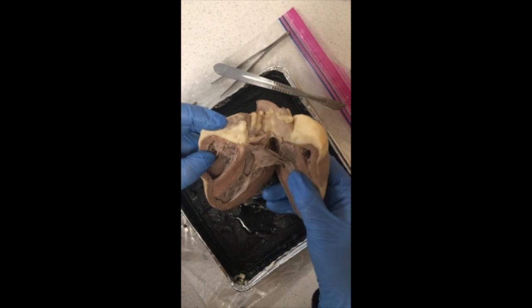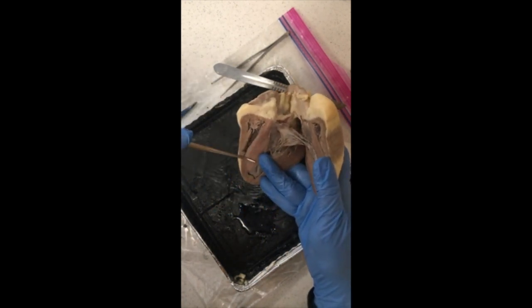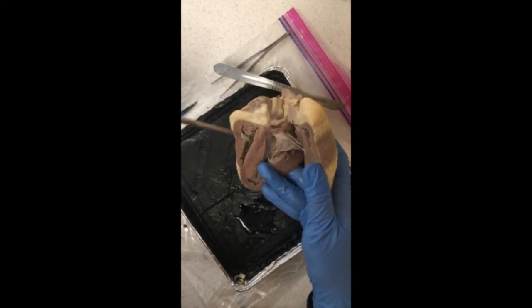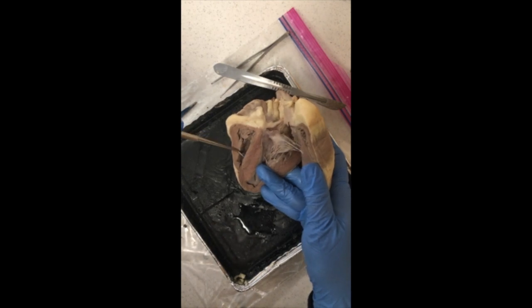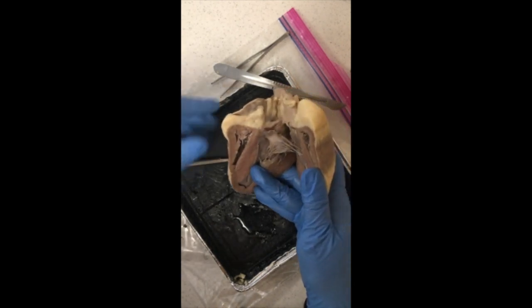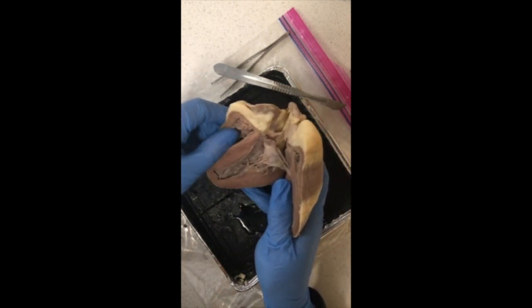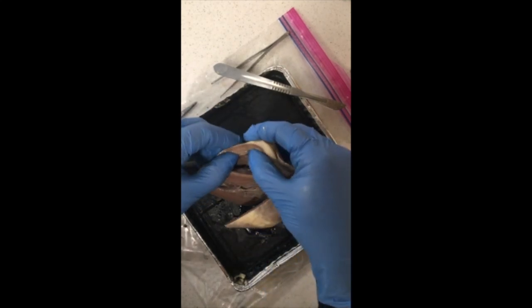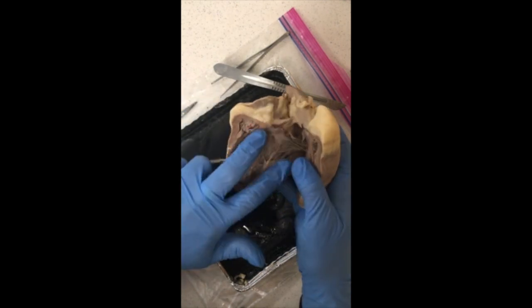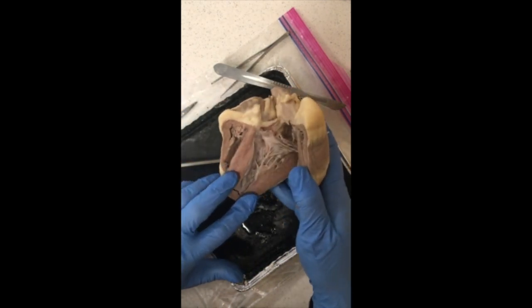As we dissect the heart, we can see the different muscle thickness in the different ventricles. We have our right atria and right ventricle here, and we have our left atria and left ventricle here. Other things to note is the thickness of that myocardium, that heart muscle. In the right side, it's more malleable, not as thick, but in the left side here, you can see just how thick that myocardium is in the left ventricle.